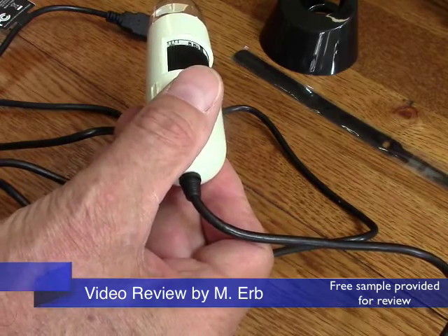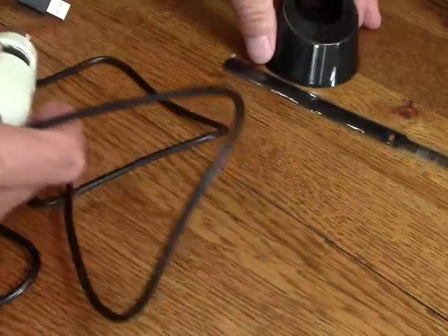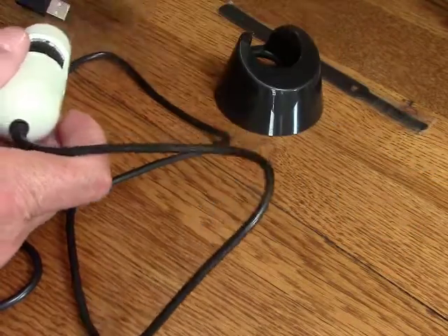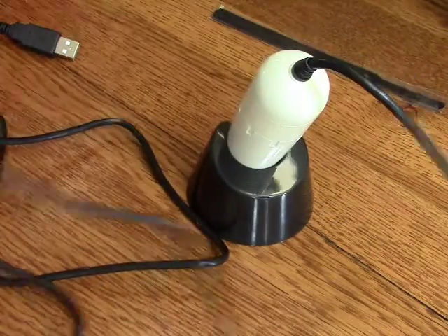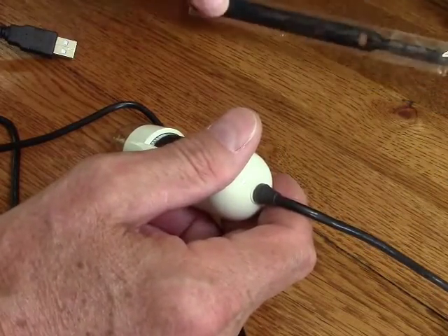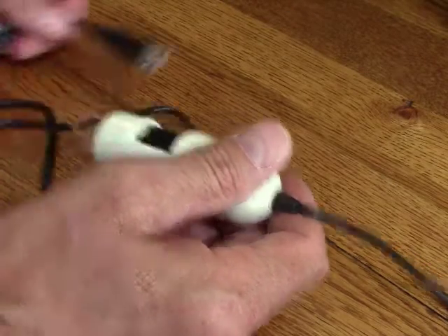It lets you get up to 230X magnification and it only comes with a couple of little accessories. This is just a simple plastic stand that you can store this in when you're not using it. And then they give you a cord management wrap that you can use to keep the cord tidy when not in use.